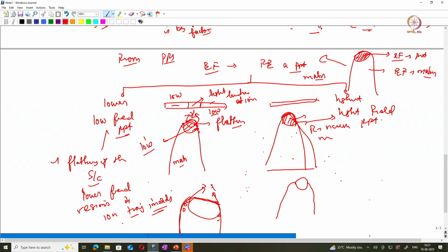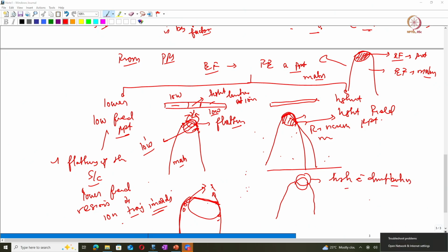Okay, and if you have a detector, in this particular region we have a high electric field distribution. Due to this high electric field, the atoms which get ionized will reflect themselves, and these ions will be deflected away from the region.